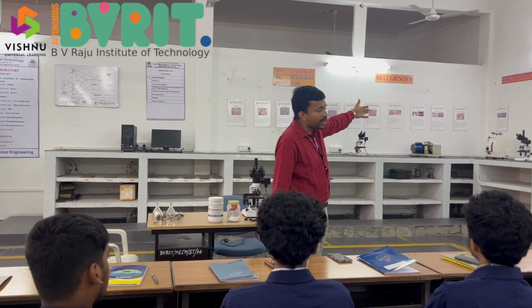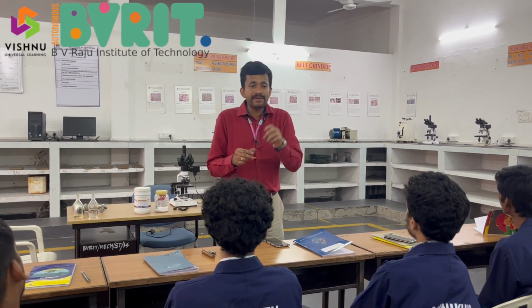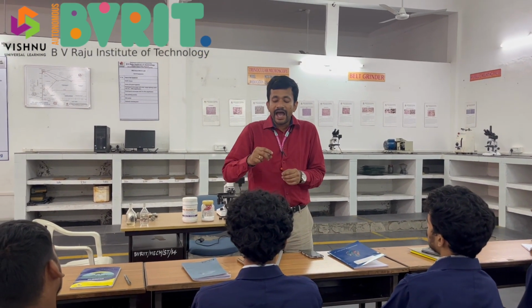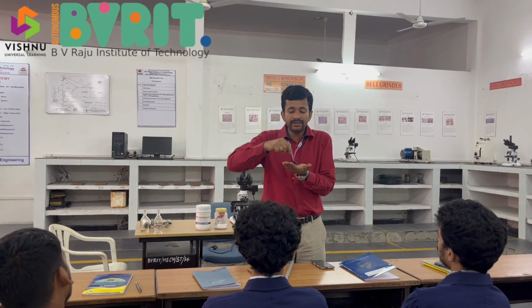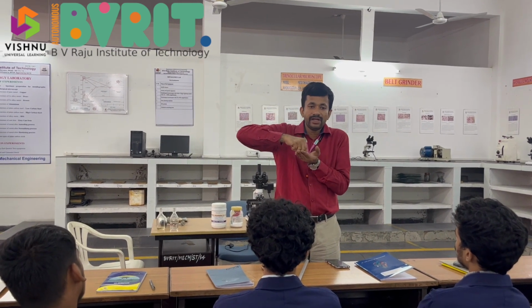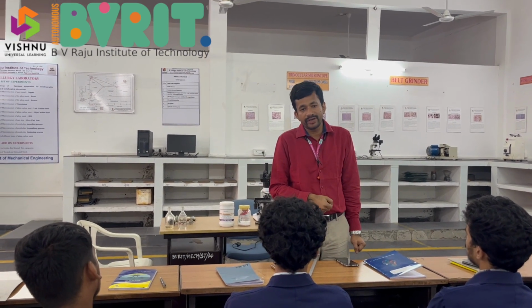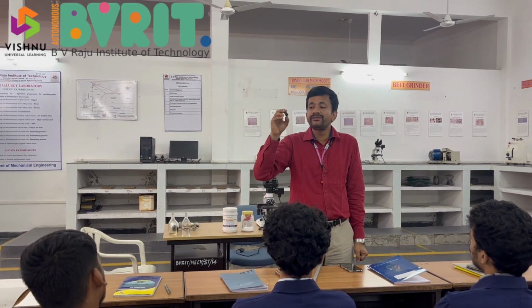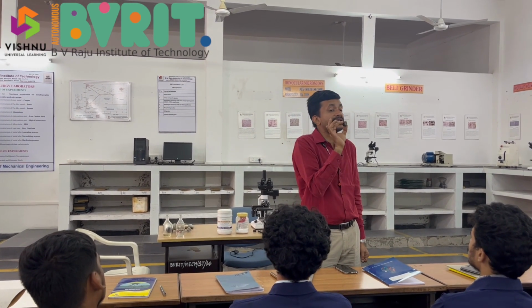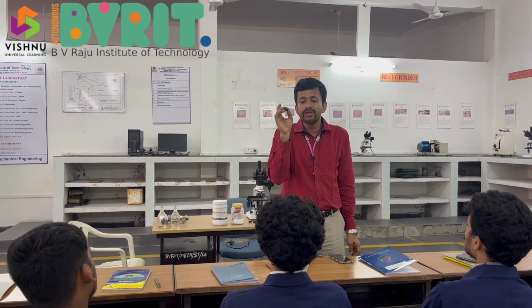So you have a hydraulic mounting press over there. In that hydraulic mounting press, we keep a known quantity of the bakelite powder, what is prescribed, and then we place this specimen and keep that powder so that the surfaces touch down, and then we heat it and apply compressive force onto it, so that it gets compacted and gives you this type of specimen. So this is how we create the specimen. The small cut pieces are transformed into the specimens.